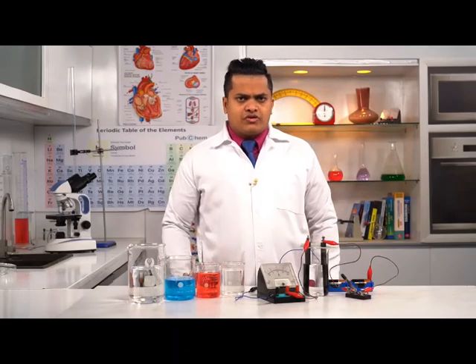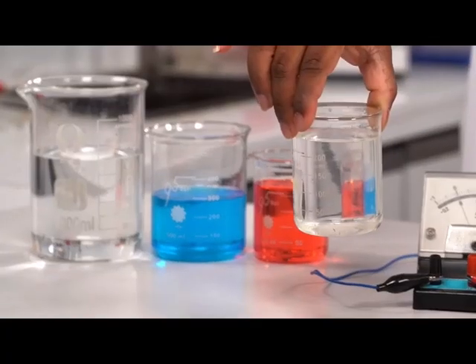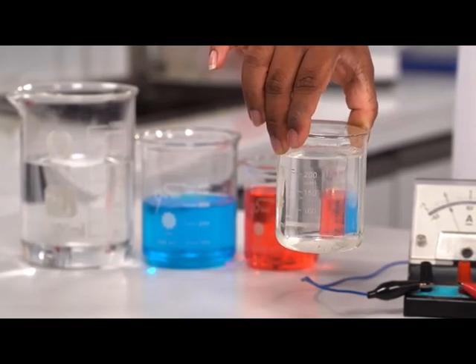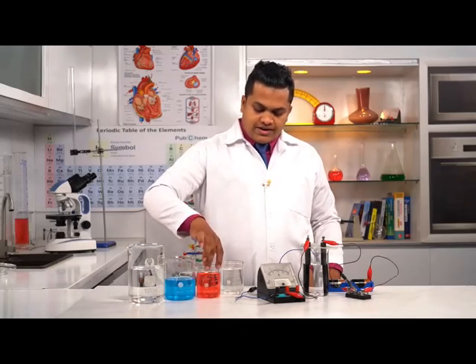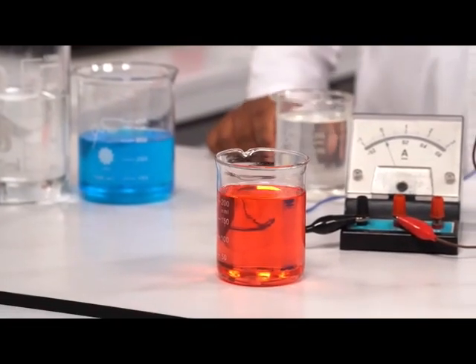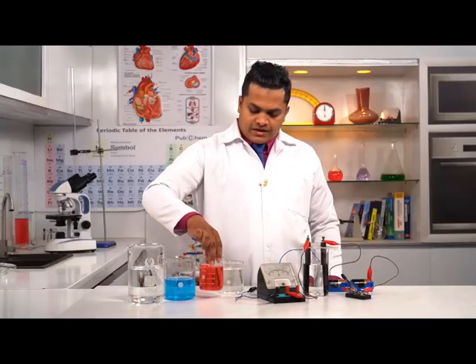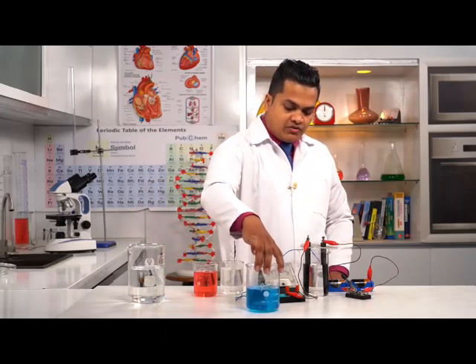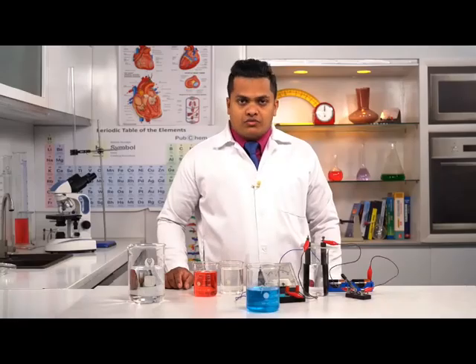Now let's identify the solutions. This solution, the first solution. Here you can observe at the bottom, there is some amount of salt also. So this is a salt solution. The solution over here that has a reddish pink color, this one, this is kerosene oil. As you can see here, this one, it's pretty obvious to observe. Copper sulfate solution, right? This is copper sulfate solution.